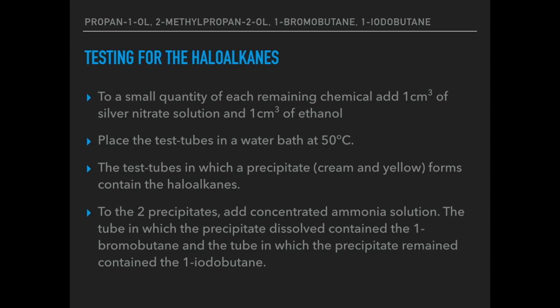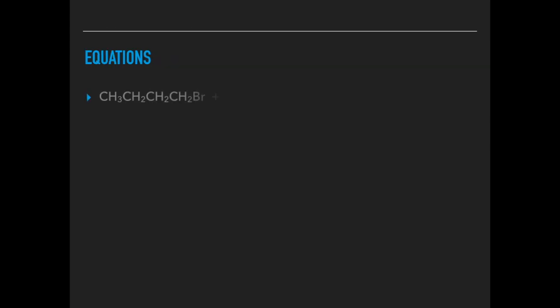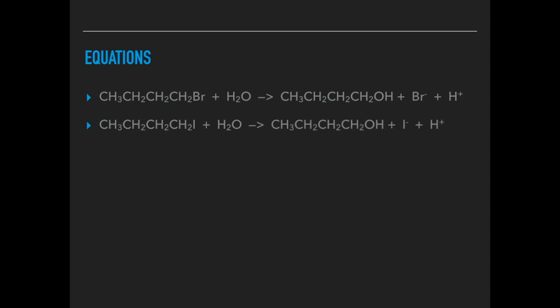Because the cream and yellow colours are fairly similar, add concentrated ammonia solution to the two precipitates. In one of the tubes the precipitate dissolves — that must be the 1-bromobutane, because silver bromide dissolves in concentrated ammonia, whereas silver iodide does not. The precipitate that remains must have been the iodobutane. The equations show the hydrolysis of each haloalkane generating a halide ion, which reacts with silver ions to form the silver bromide or silver iodide precipitate.